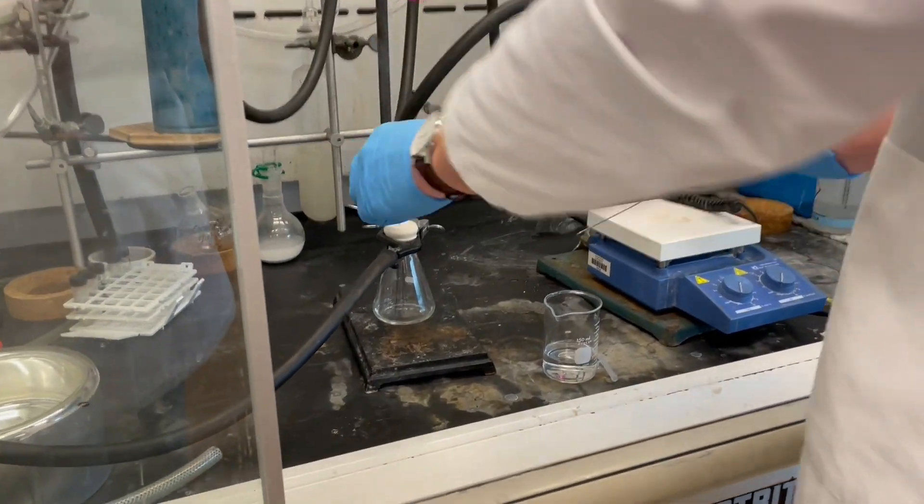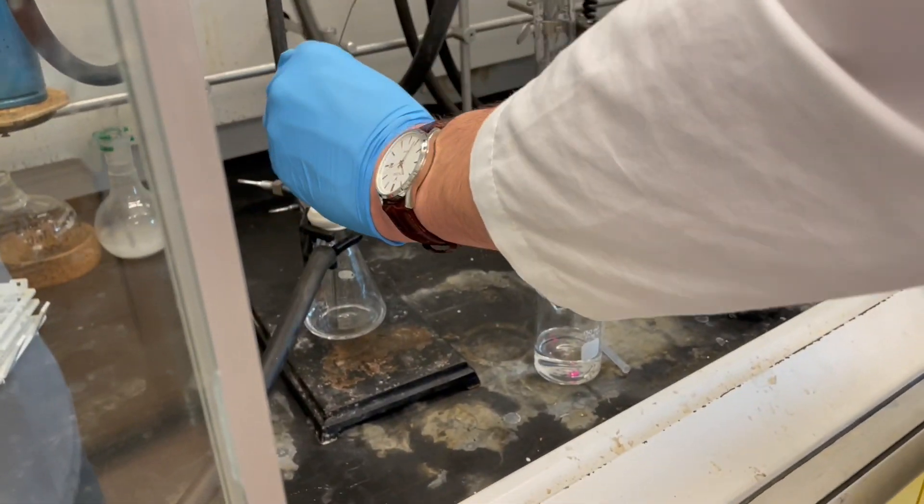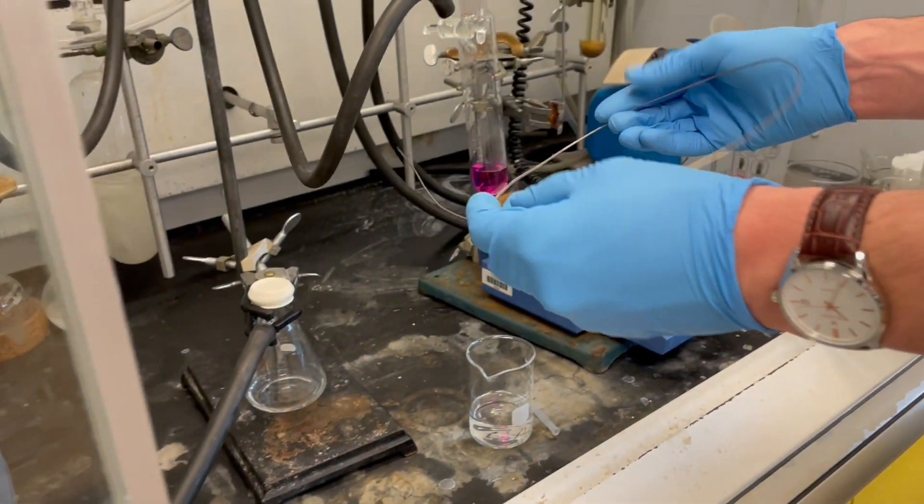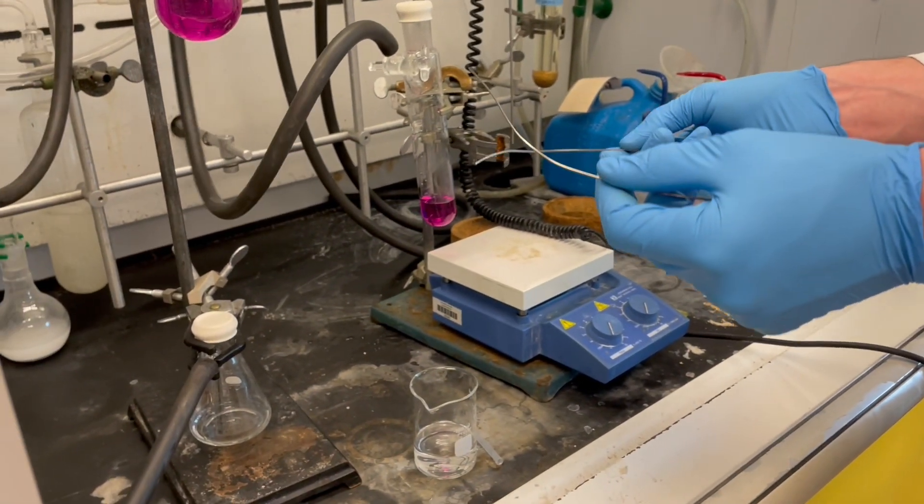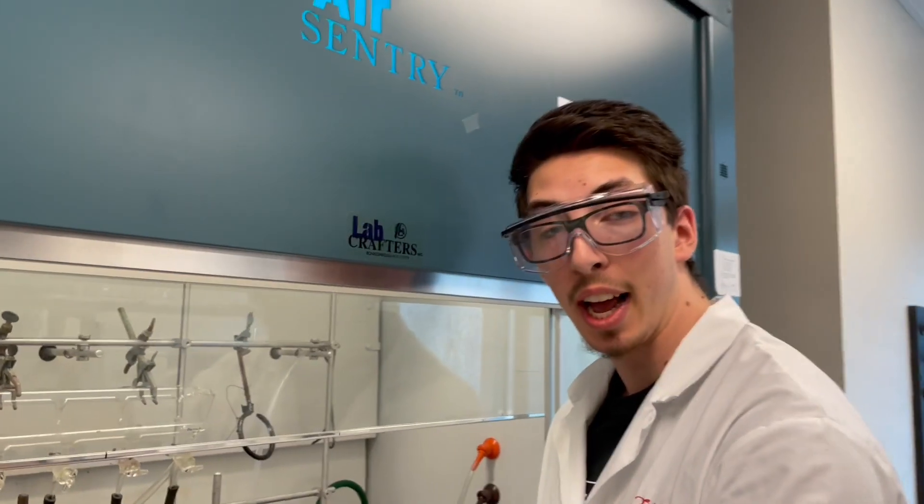Once it's clean, we'll rinse the outside with acetone, rinse it with water, rinse it with acetone one more time, and put it in the oven. And that's how you perform a cannula transfer.